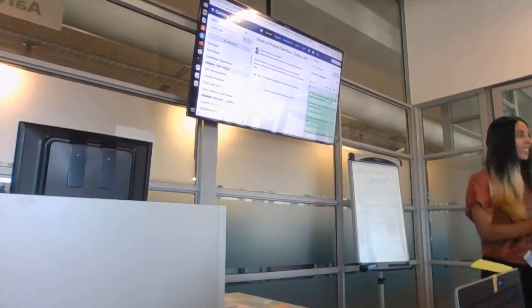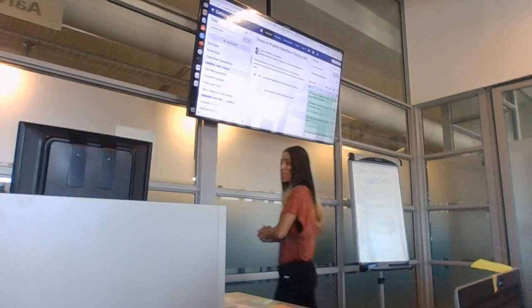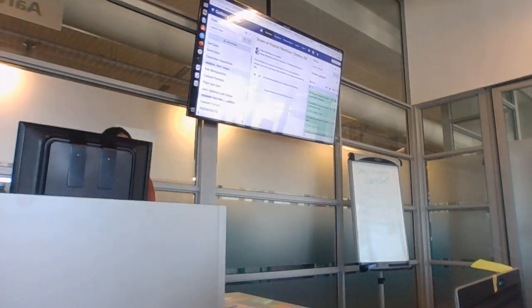If you're confident that everything is right, you're now a bioinformatician and you want to also be useful to the Bioinformatics Society, you're generous, you can publish it, make it publicly available, and you can also send it to an individual person.